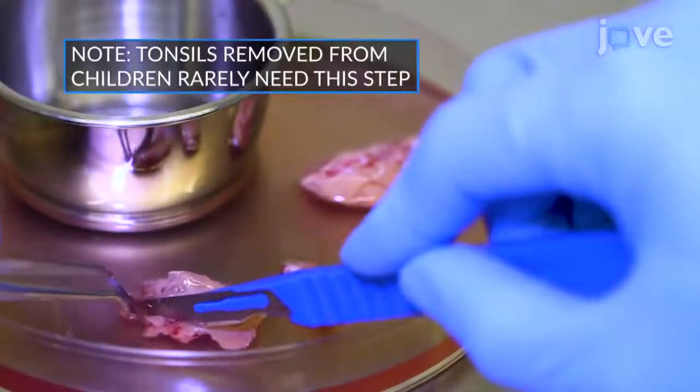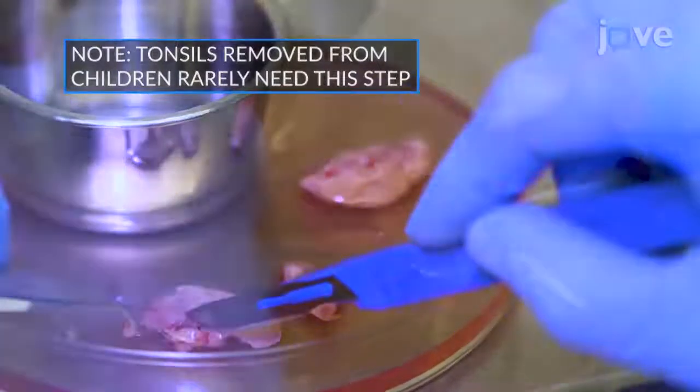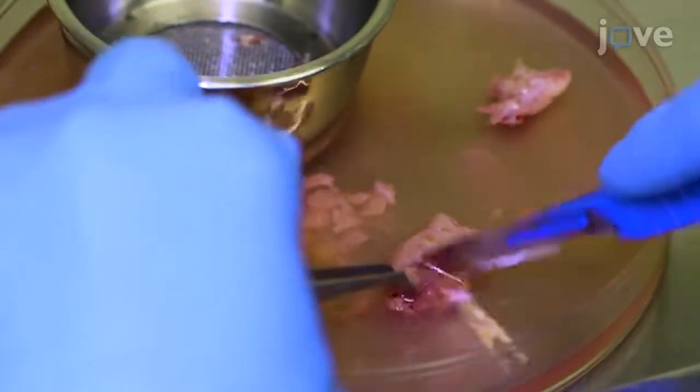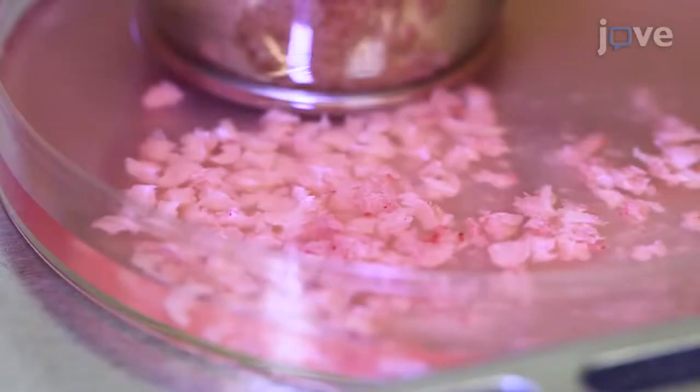Remove cauterized, bloody, and fibroid tissue using forceps and a scalpel. Using the scalpel and the curved tweezers, cut the tissue into small pieces of less than half a centimeter in diameter. Cut all the tissue so that the small pieces can be immersed at all times.